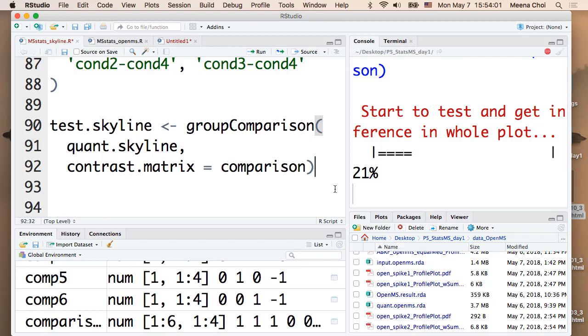Can this command use the clusters to speed up? I don't remember. Just try. Yes, but I don't think so. Cannot, yeah.